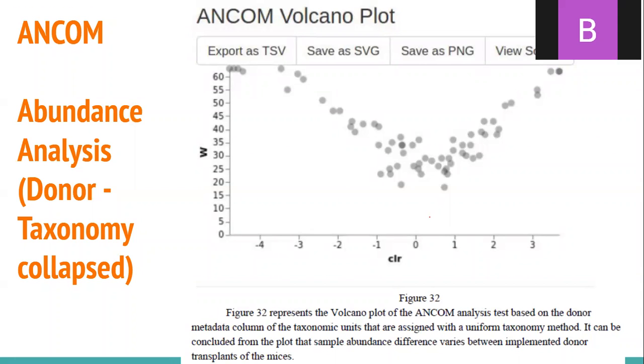And the variants that reject the null hypothesis for genotype and donor type were investigated again. But after that, there's an interesting thing that has been done. I used the taxonomic assignment with the random forest classification method for obtaining the collapsed fixed sequence variants at the species level, using the abundance taxonomic analysis for the donor only, by the way. This is for the validation of whether the test was done properly or not.